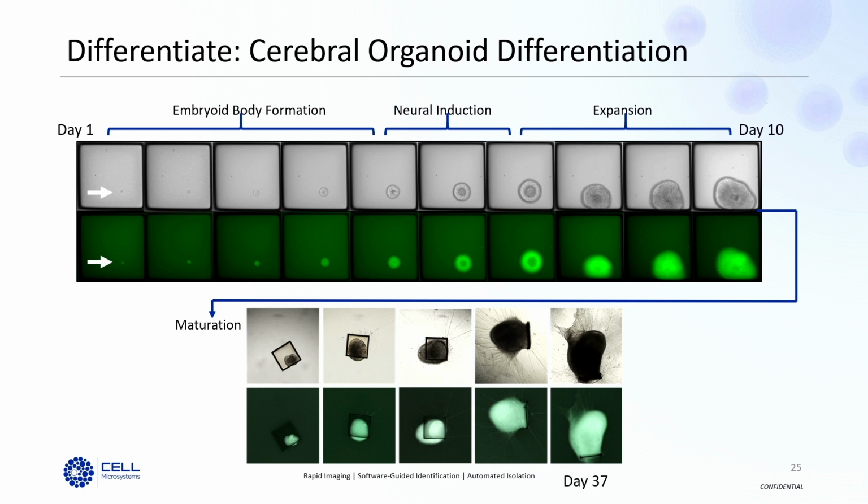When you're in a single organoid state, is there additional ECM there? The organoid can continue to grow, or does it always stay within the raft? Yeah, that's a great question. There's two parts to that question. So the first part is for most of our organoids, we do spike in an extracellular matrix suspension into the 96 well plate. For some organoid types, like your cystic organoids that have a hollow lumen, they're a little bit more reliant sometimes on needing that ECM.